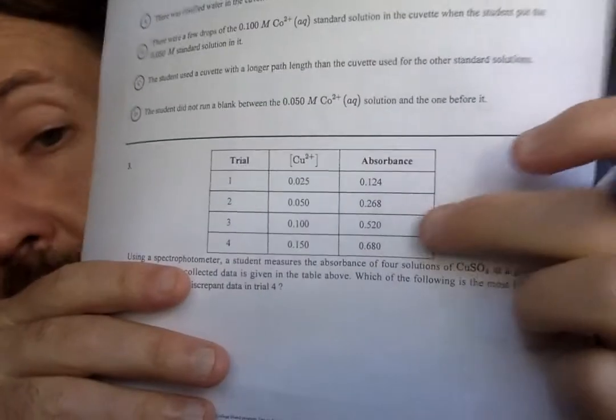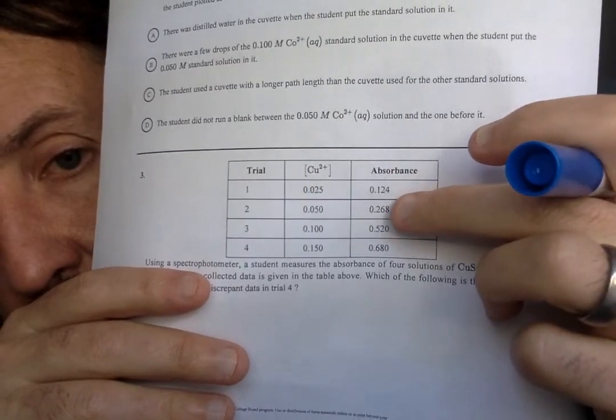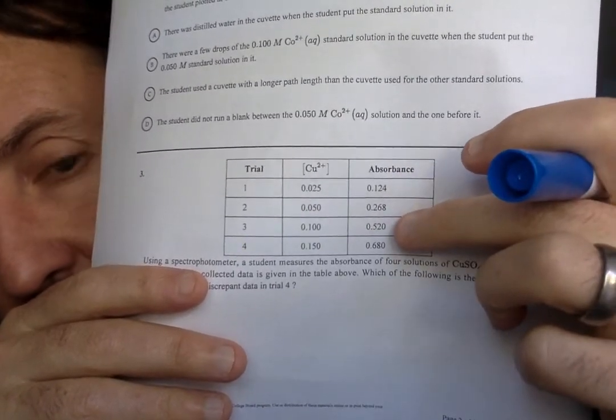Okay, now that you're back, here are the possible reasons why that data was discrepant. And what was discrepant, you may ask? You might not know at this point. What's discrepant is, look, from here to here, it doubles. Here to here, it basically doubles, and here it doesn't double at all. So the discrepant data is at trial 4 at 0.150 molar, it doesn't double. It doesn't go up as much as we'd think.